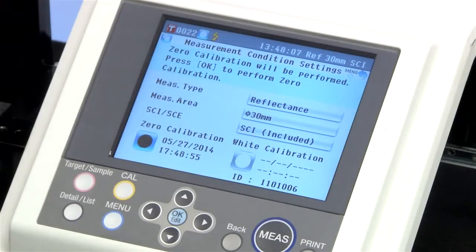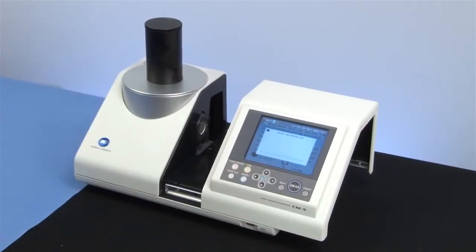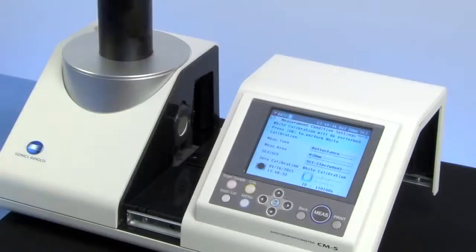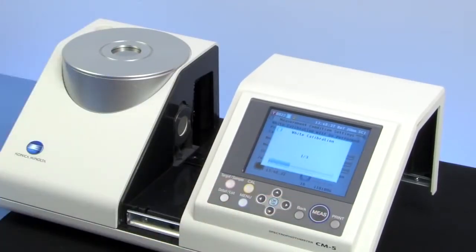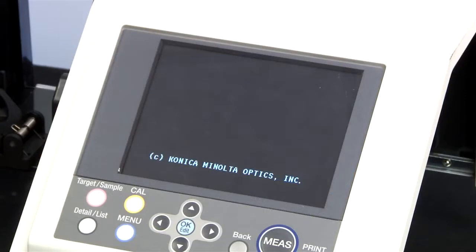To begin, just switch the instrument on, perform zero calibration, and then white calibration before each color measurement session. There is also an option to perform white calibration automatically.